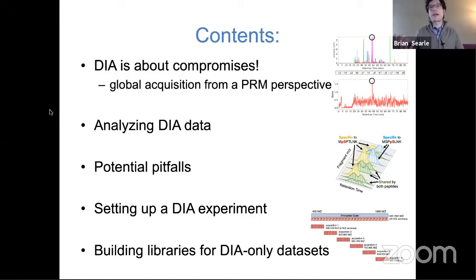But from our perspective, we figure why collect just a precursor scan when you could just be collecting fragment scans instead, because the fragment ions are much more specific, and you also have the ability to throw out fragment ions, as opposed to with a precursor where you only have those 3 measurements at your fingertips.